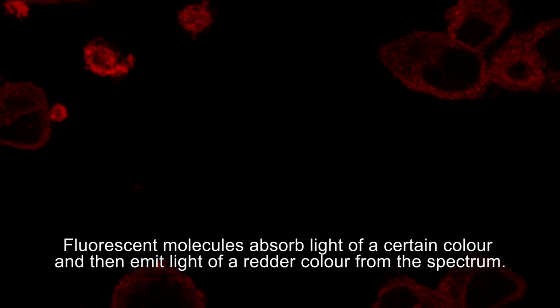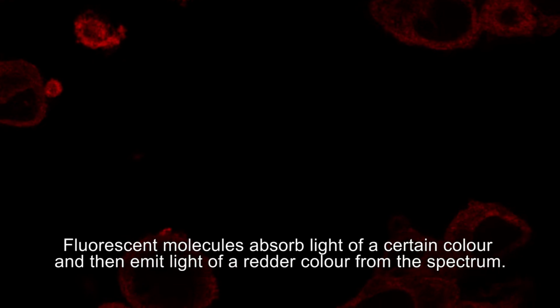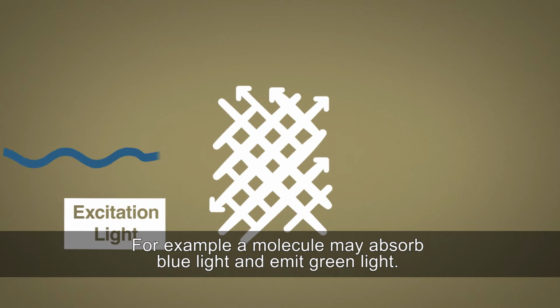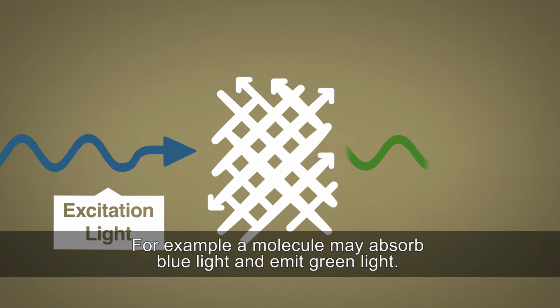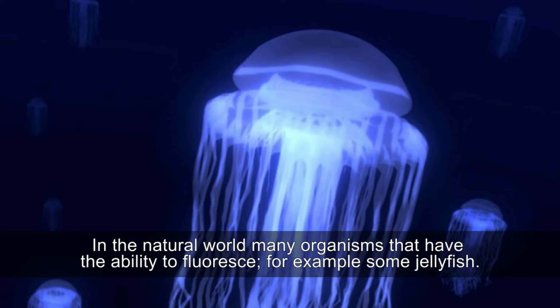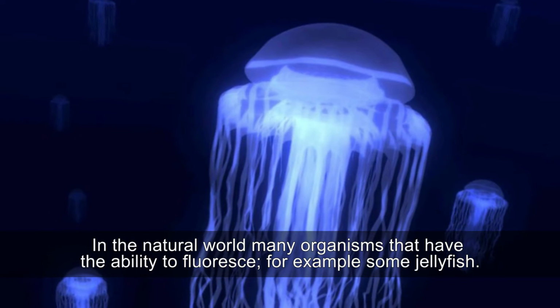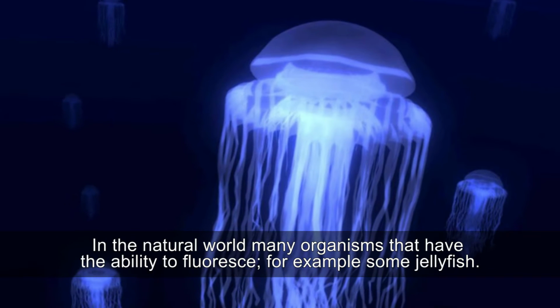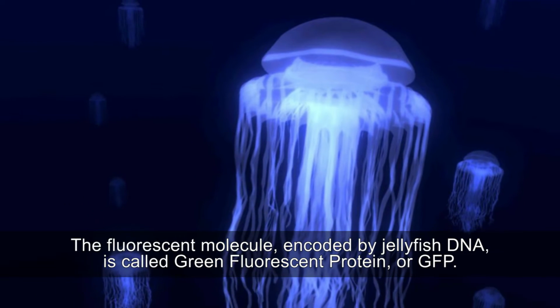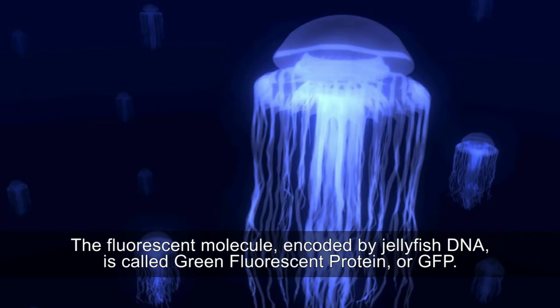Fluorescent molecules absorb light of a certain color and then emit light of a redder color from the spectrum. For example, a molecule may absorb blue light and emit green light. In the natural world, many organisms have the ability to fluoresce. For example, some jellyfish. The fluorescent molecule encoded by jellyfish DNA is called green fluorescent protein, or GFP.